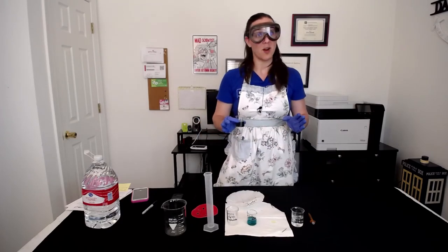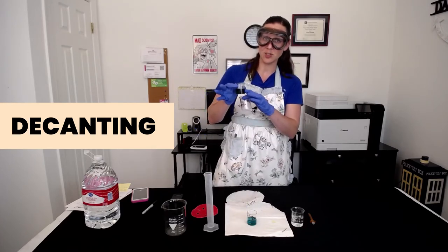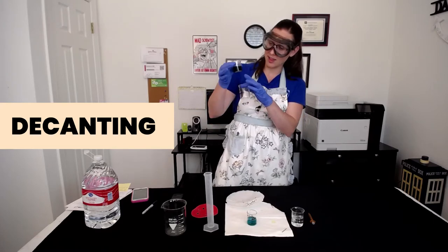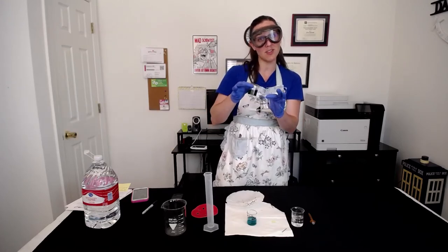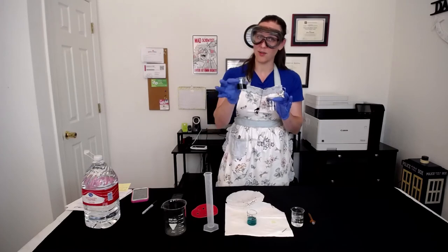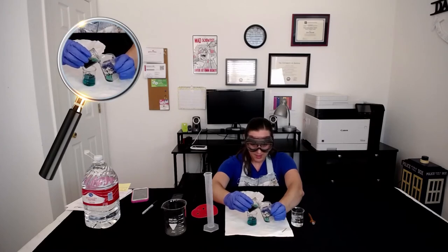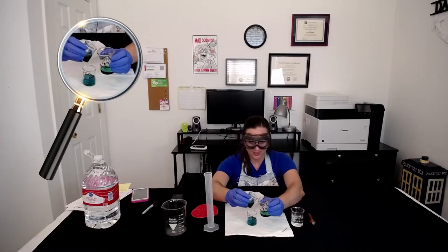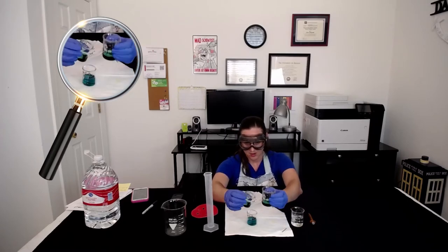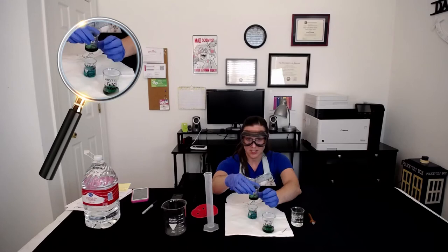The next thing we need to do is a process called decanting. Decanting just means that you're going to be pouring off this liquid solution into another waste container, leaving all the solid copper that's formed on the bottom behind. We're going to try and transfer as much of the liquid as we can without removing the solid from our reaction vessel. Very carefully, you're going to want to pour off this liquid — the solution — which is going to be either our iron 2 or iron 3 chloride solution. Notice that I don't have any solid copper in this decanted waste beaker; I'm trying to leave all of my solid in here.